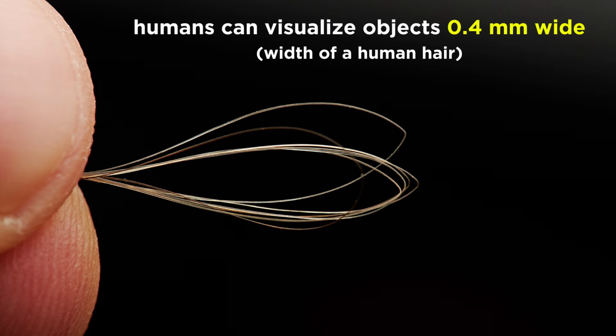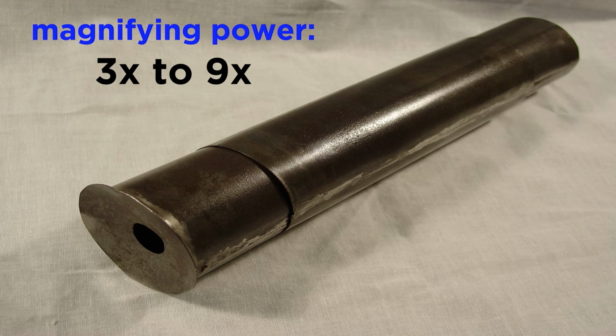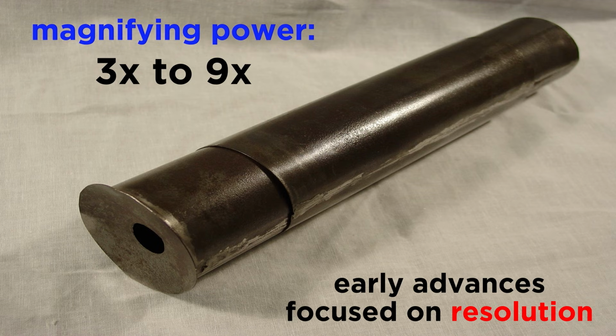Before this microscope, the smallest object people could visualize was the width of a human hair, which might seem small, but is actually quite large compared to the microbial world. Janssen's microscope allowed for the visualization of objects 9 times their original size. Early advances in microscopy after the invention of the first compound microscope revolved around the aim of producing better resolution, as improving magnification was not as tricky.